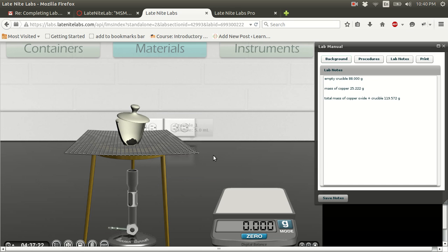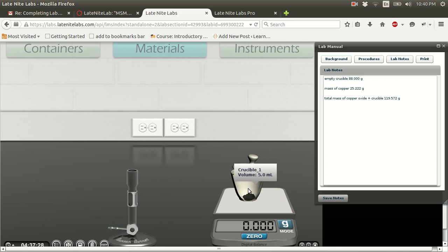And the chemical reaction was with the air in this virtual lab. So oxygen came in here. So this thing is heavier than it used to be. I didn't put anything in here, yet it is heavier by about 6 grams than it used to be. Something must have come in here. What is it? It was air. Air molecules came in, and usually you don't weigh air molecules, but in this case there was a chemical reaction, and so a whole lot of air molecules got used up and incorporated in with this solid.